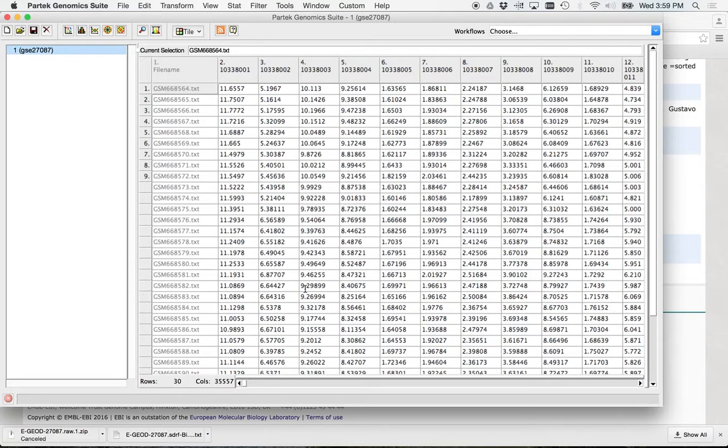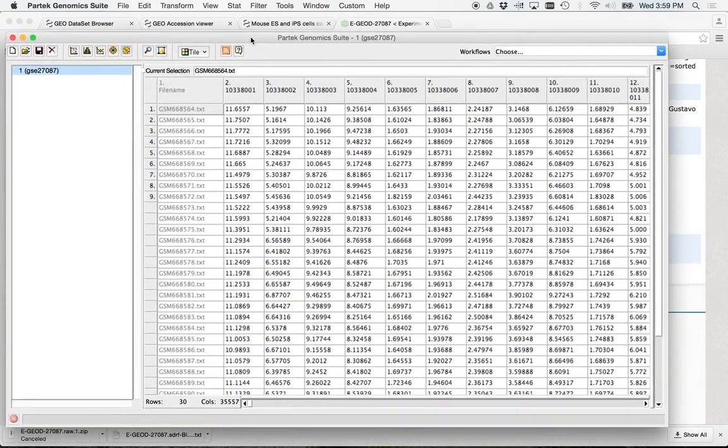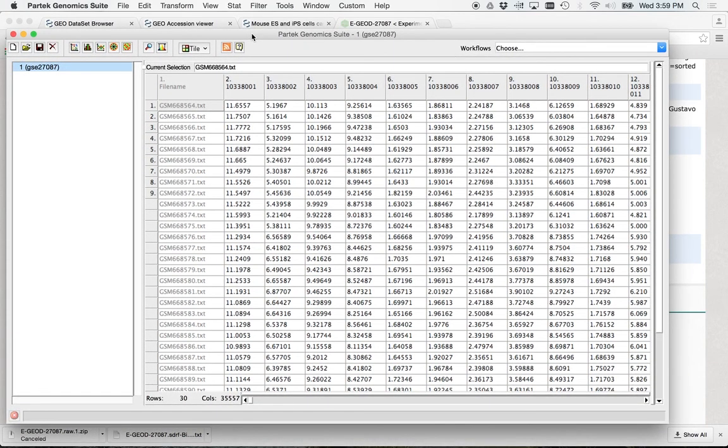Now, as you mentioned, there are no categories, right? We've got all this pretty expression data, but we don't have any way to analyze it. We have no comparisons. Is your array file, annotation file, downloaded pretty much? Is it really? Yeah. Okay. Give it a minute. In the meantime, so here's the deal. In the meantime, we can do this.